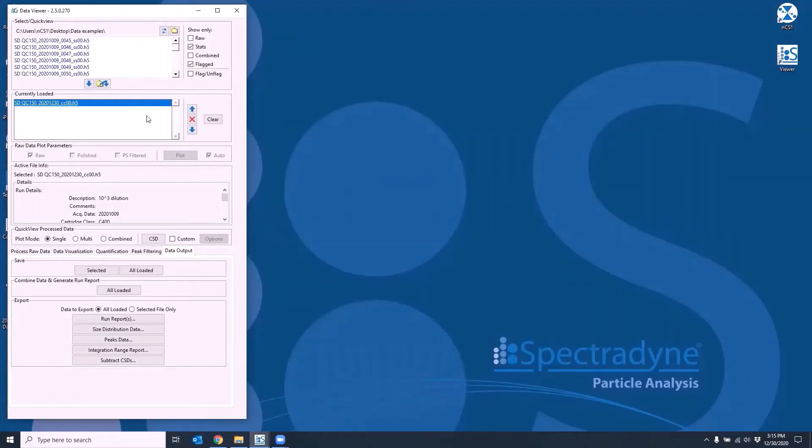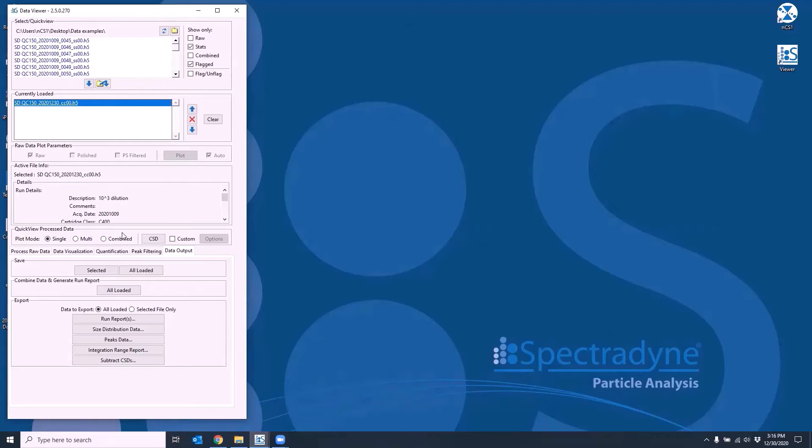Once the combined file has been created, you can still change it as you wish and save the modified version by clicking the selected button for a single file or all loaded button to save all files currently loaded in the frame. This will create new combined file and does not overwrite the previous file.